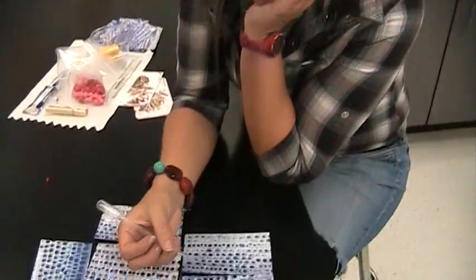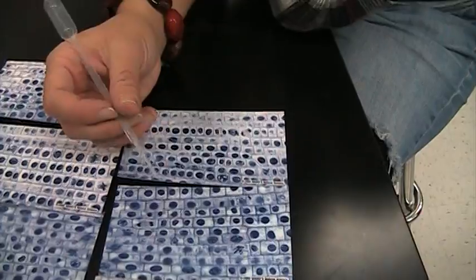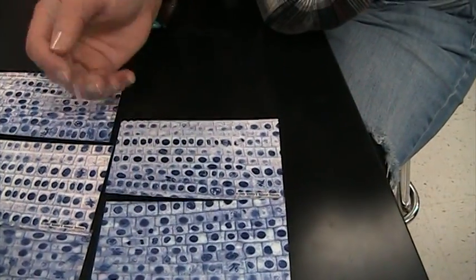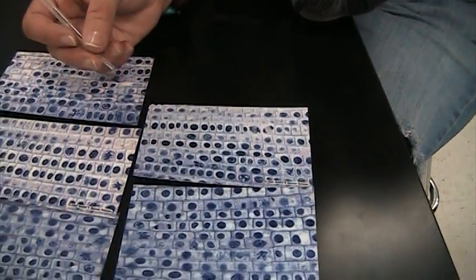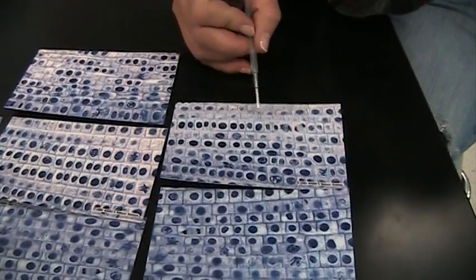Hi there. Today I wanted to show you some different stages of mitosis looking at animal cells. In the lab that we're working on, you need to be able to identify the different steps of mitosis looking at these different animal cells.